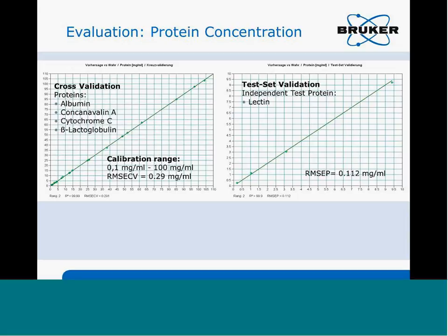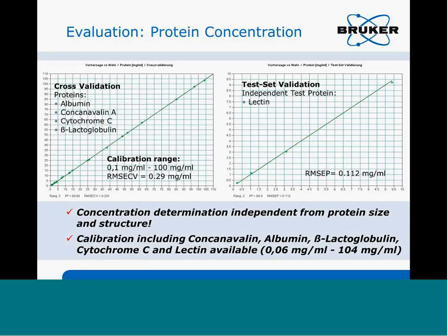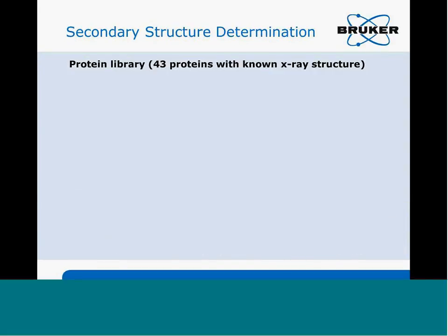This model. So this is the thing which we can do: concentration. Second, structure. It's easy to figure out the secondary structure of a protein.